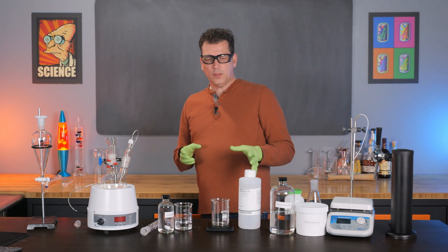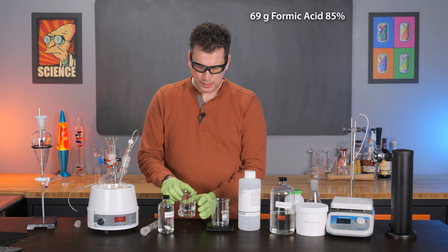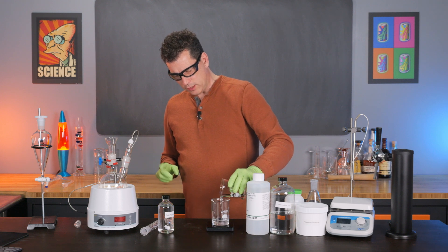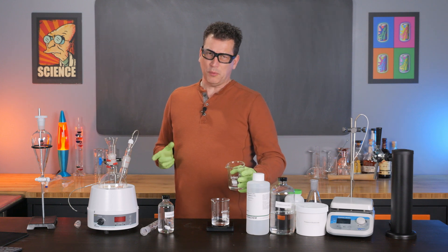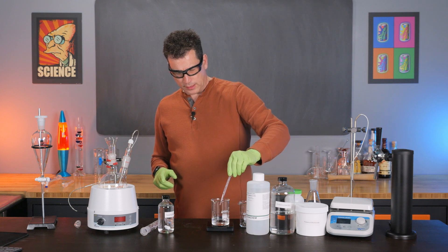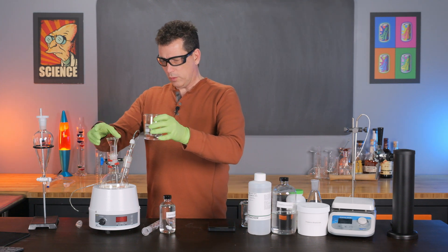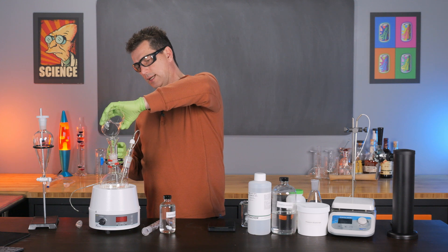The first thing we're going to do is weigh out 69 grams of 85% formic acid. I've decanted it into a beaker just because this bottle doesn't pour well. We ended up at 68.89 grams, which is sufficient for what we need. Then you simply pour that straight into the reaction flask.